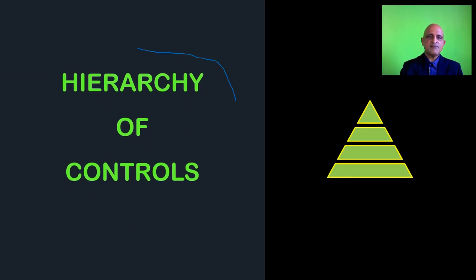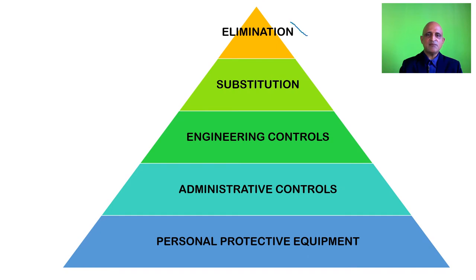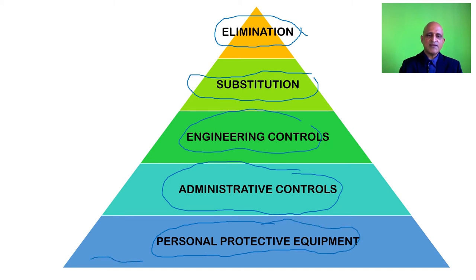We will look at the five controls and their hierarchy. The five controls are: elimination, substitution, engineering controls, administrative controls, and personal protective equipment. Personal protective equipment provides the last line of defense against the biological agent, which is why it is placed right at the bottom of this hierarchy.